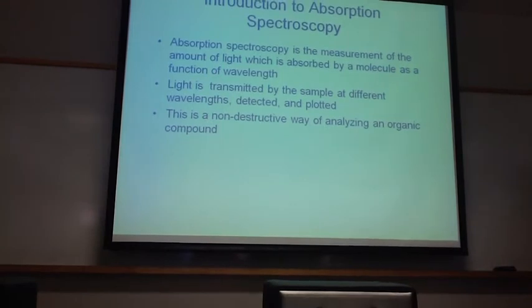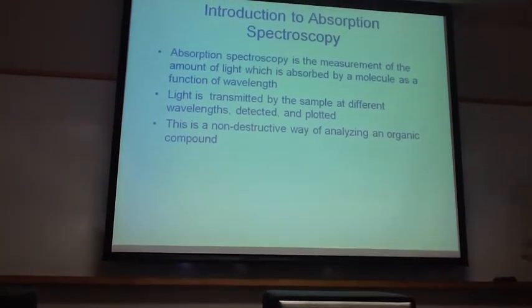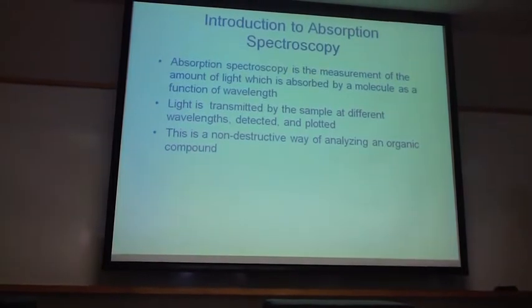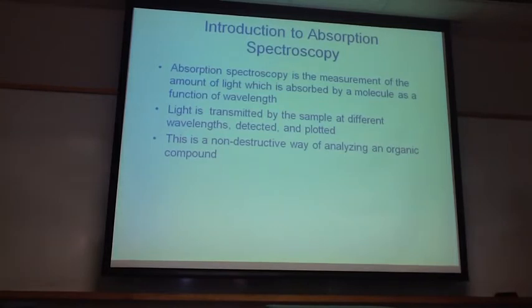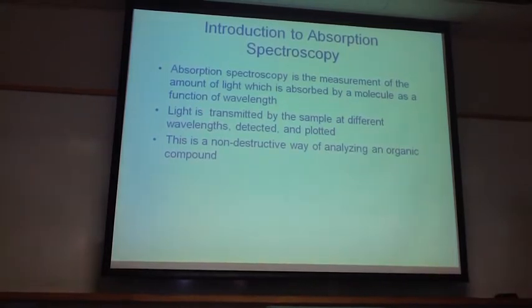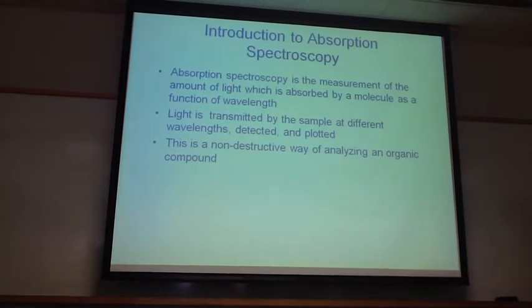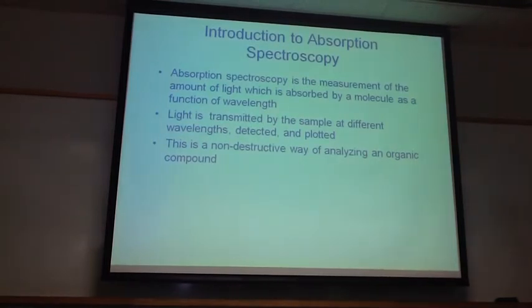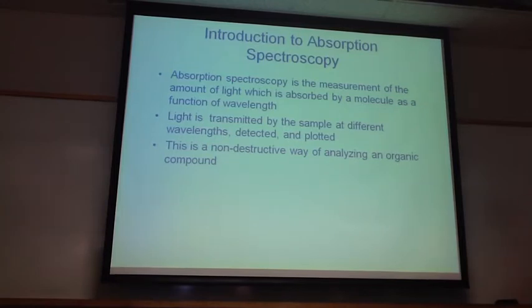Much light is being absorbed by the compound, and depending on the light you shine onto the compound, different things will happen. For infrared, it will absorb the infrared, and in that region, the bonds will start moving and shaking. A good thing about all of the spectroscopy is it doesn't destroy the sample. It's going to either let the light pass through, or absorb it, but it won't break apart into pieces.